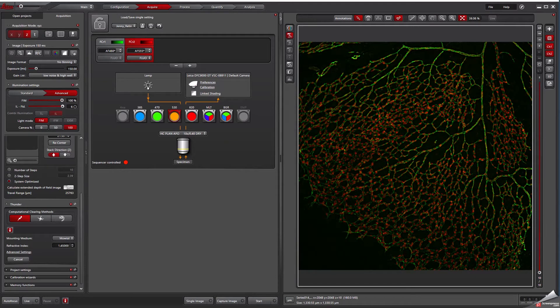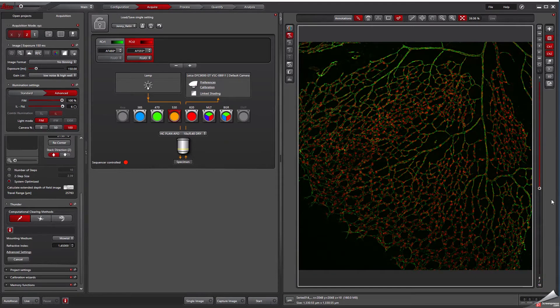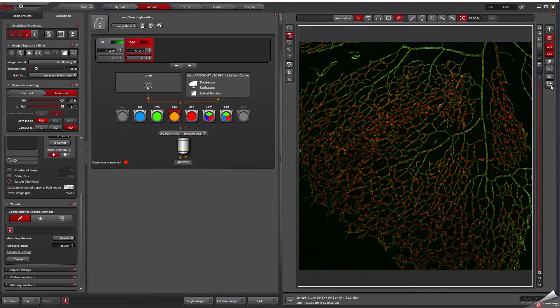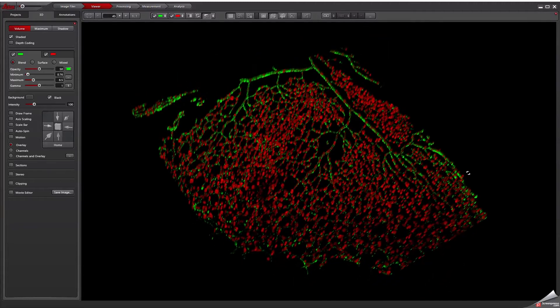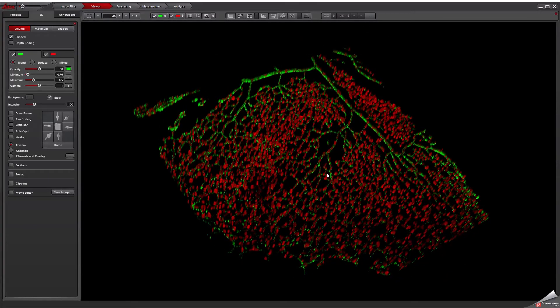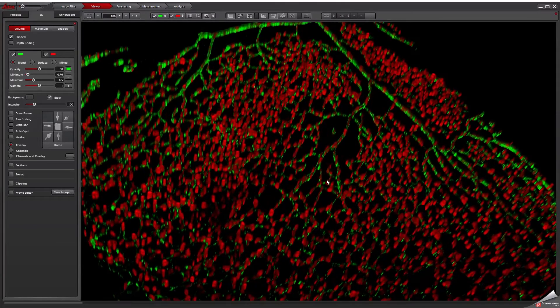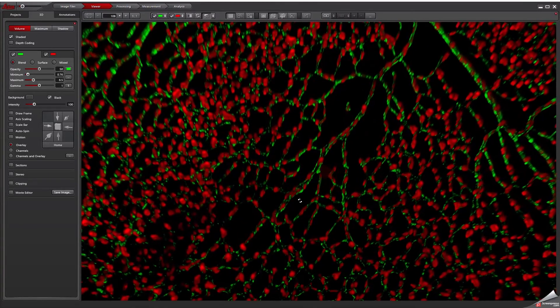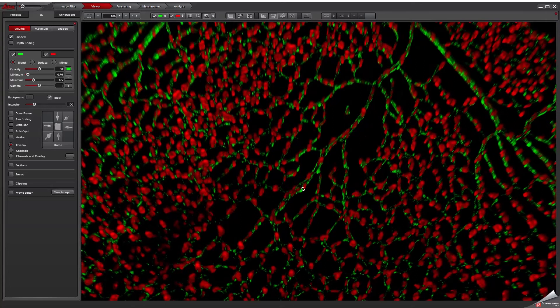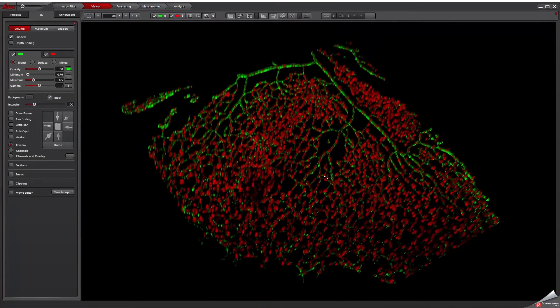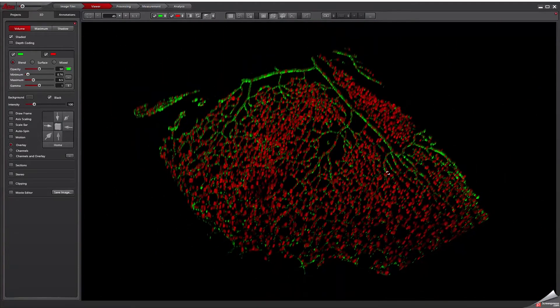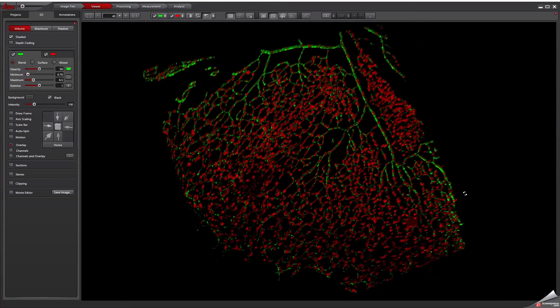Now we proceed with our acquired Z-stack, which shows details of structures even deep in the specimen. Thunder images with Computational Clearing enable the meaningful quantification of thick tissue specimens with the speed and ease of use of wide-field microscopy.